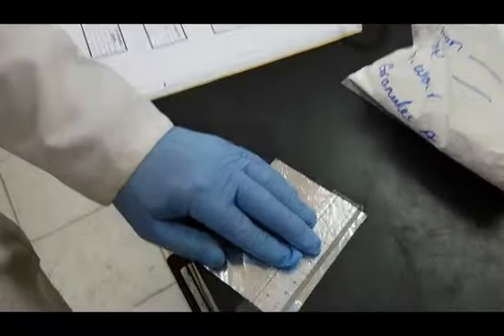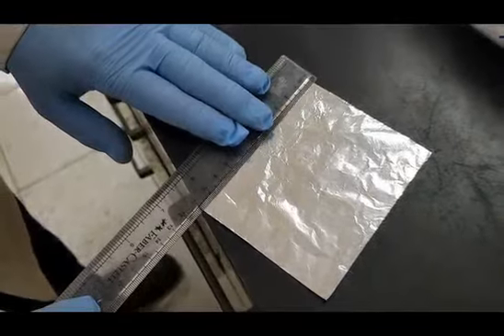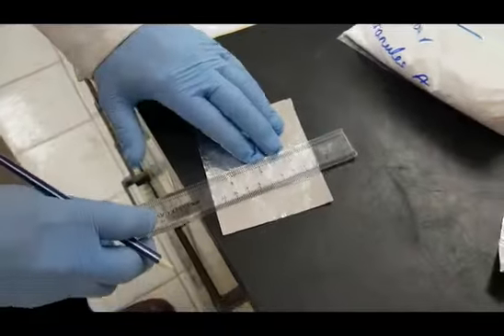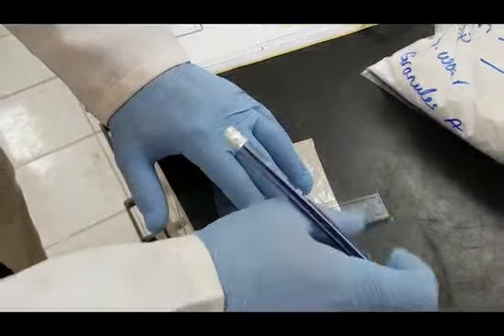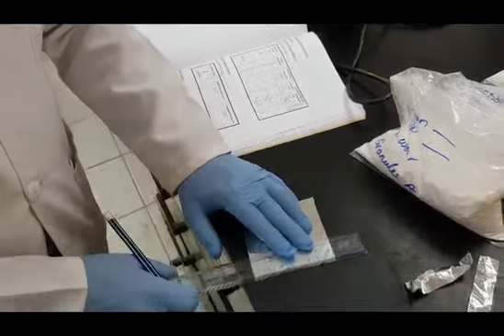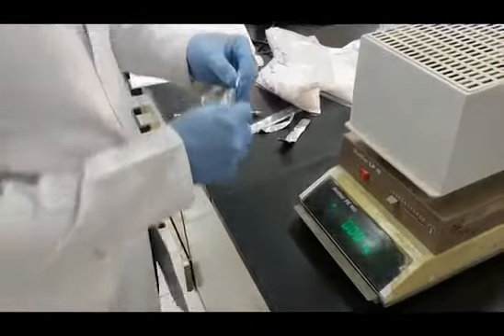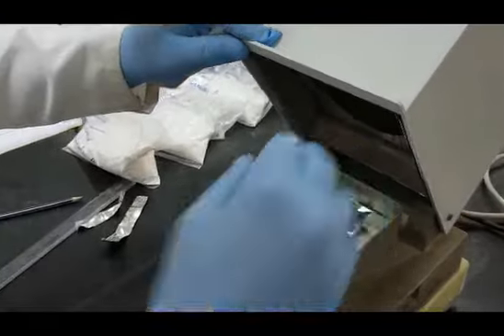Please, minimal disturbances and movement should be guaranteed when measuring the wet and dry weight of your particles, because the moisture content apparatus is too sensitive to movement around.